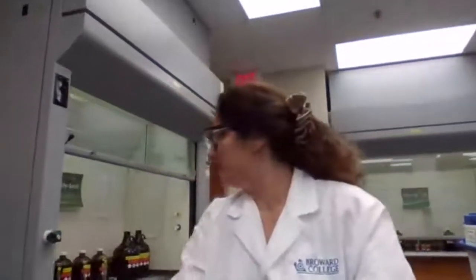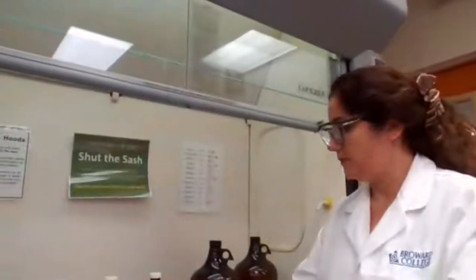Going to take you to the fume hood, so we can add the HCl inside the fume hood here.